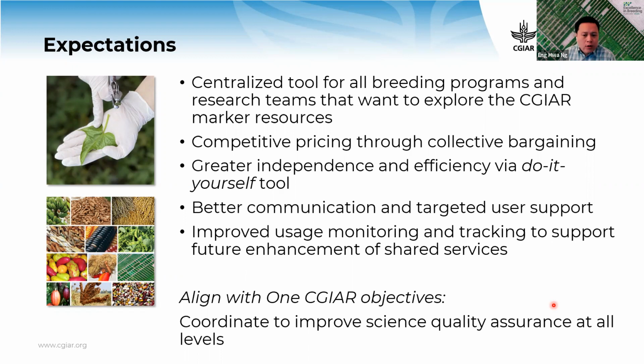And in terms of support, once the tool is fully rolled out, users and service coordinators will also be able to monitor and track submission progress for each and every single job, because this is now a database. Soon these features will have a demo, and some of the features will be shown by our colleague Nick.